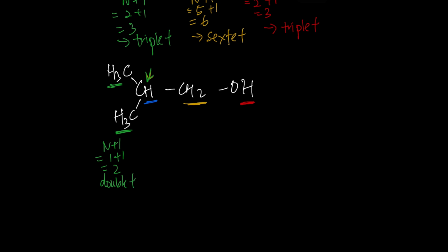For this proton, the neighboring protons are this and also this.